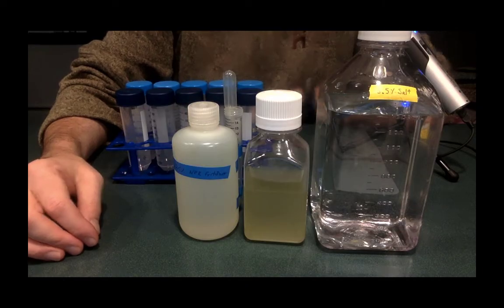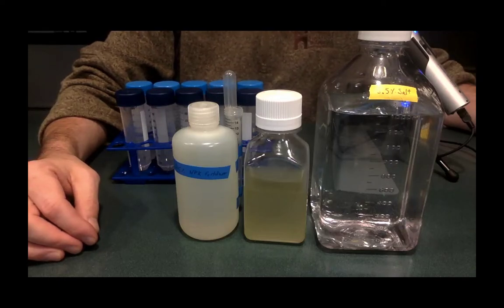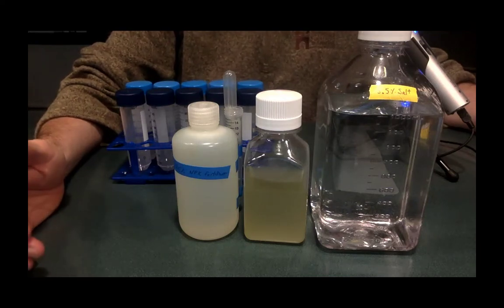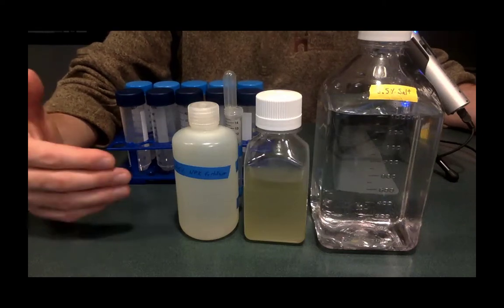Hey everybody, this is Mr. Matthew here, and I'm going to give you a quick walkthrough of some of the key pieces of how to put the population growth of algae lab together. Now, I'm not going to give you every bit of detail in here, but I'm going to give you some examples about how to set it up and some of the materials that you're going to use.